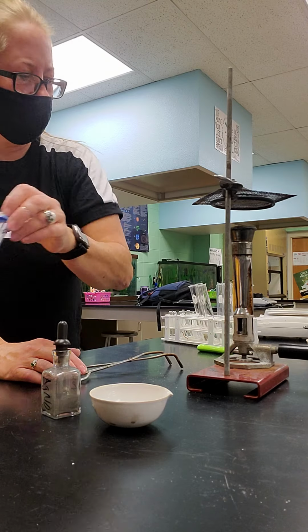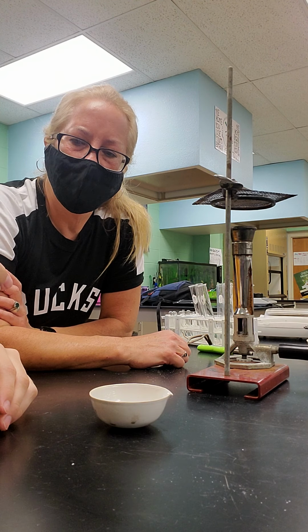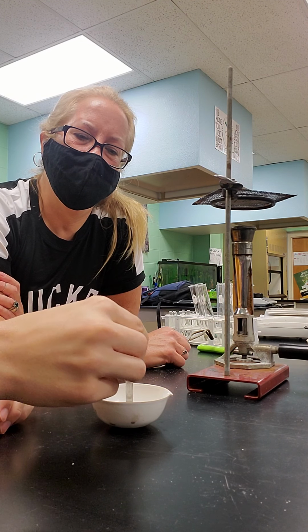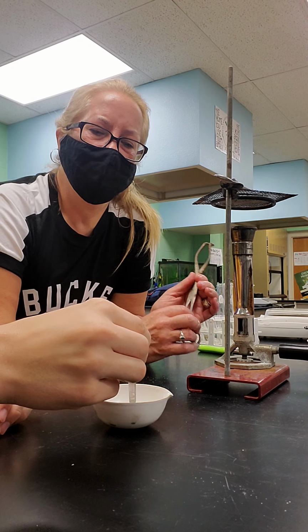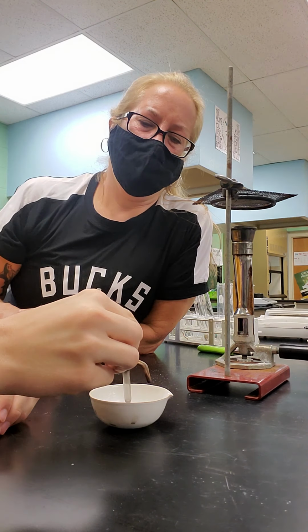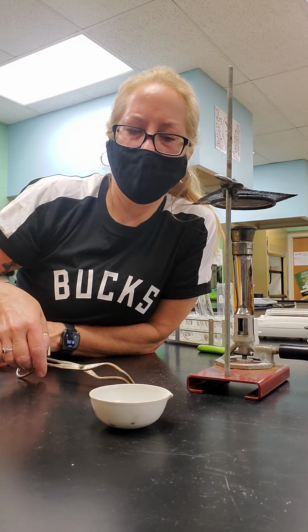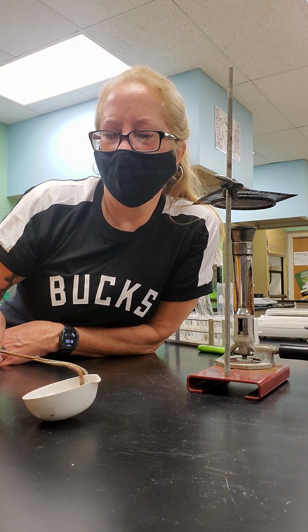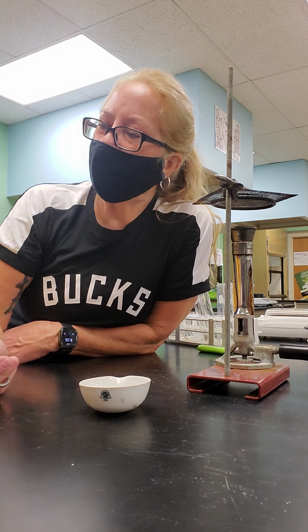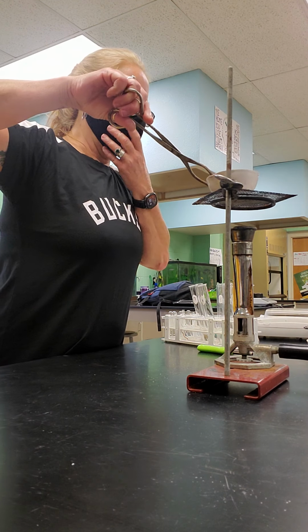And now you're going to add 10 drops of silver nitrate. Okay, was that 10? Yeah. All right. So what happened, Will? It turned white, and there's a precipitate. Turned white, precipitate, right there. Now we're going to evaporate that away.